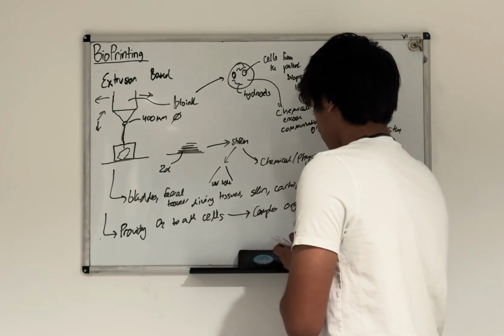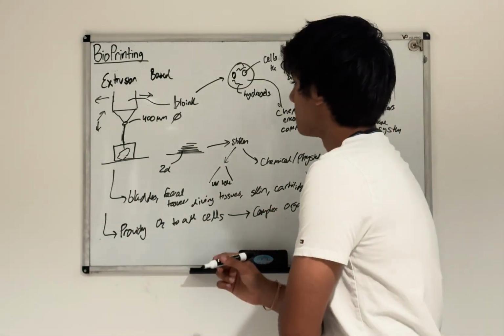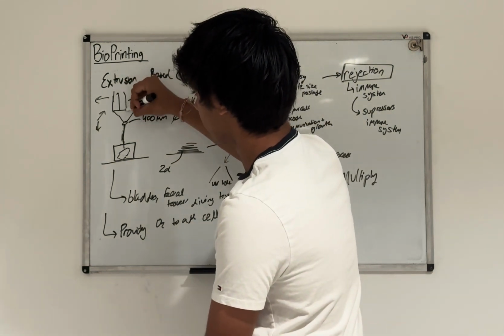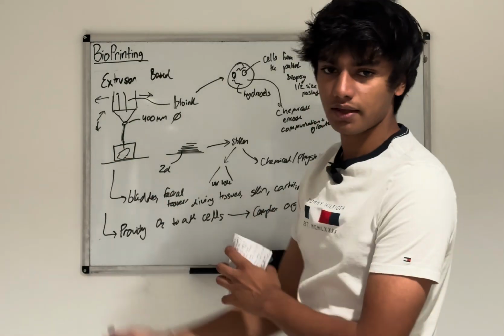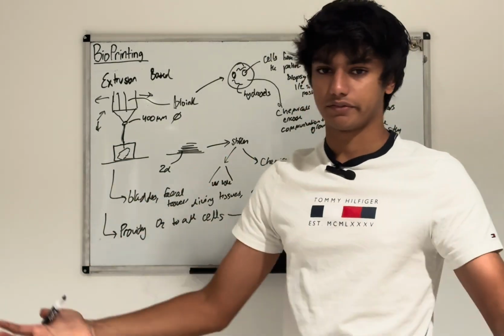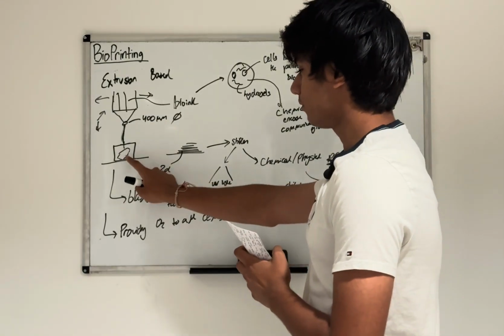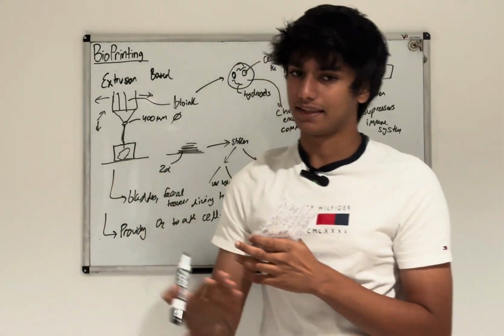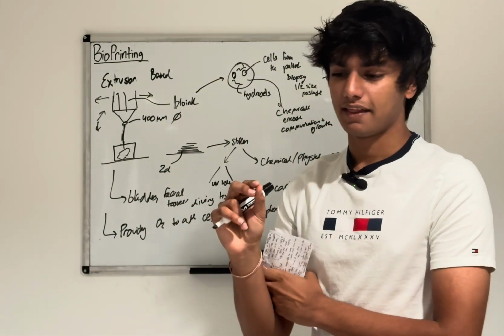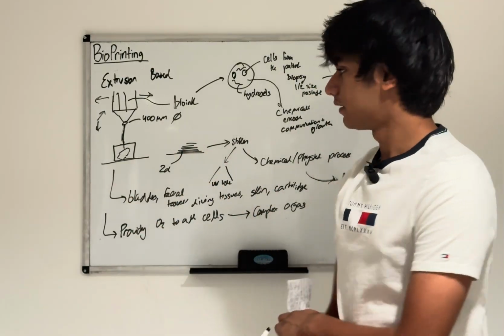Additionally, complex organs also require different types of cells, which makes it even more challenging to use this process. Because again, you could add more fluids. You can imagine that we could have different fluids in here with different cells of bioinks. But if complex organs require a lot of different types of cells, it becomes way harder to create. And it's also kind of hard to make the structure, because it requires a lot of precision that is hard to achieve, even with this expensive, delicate machinery.